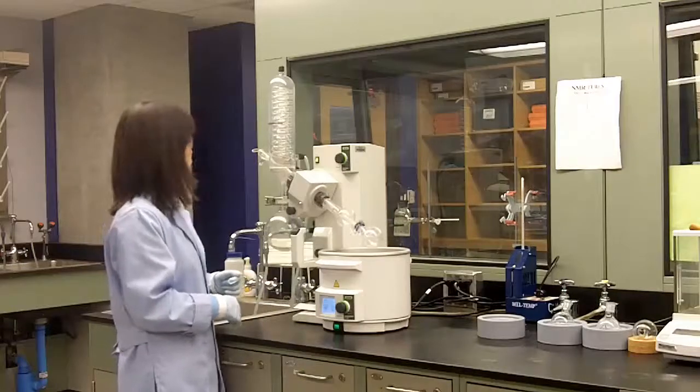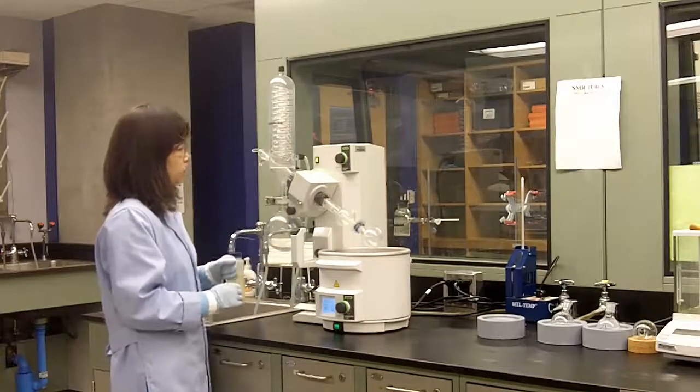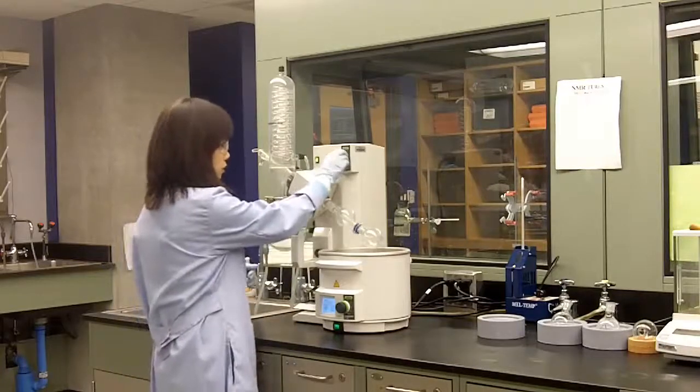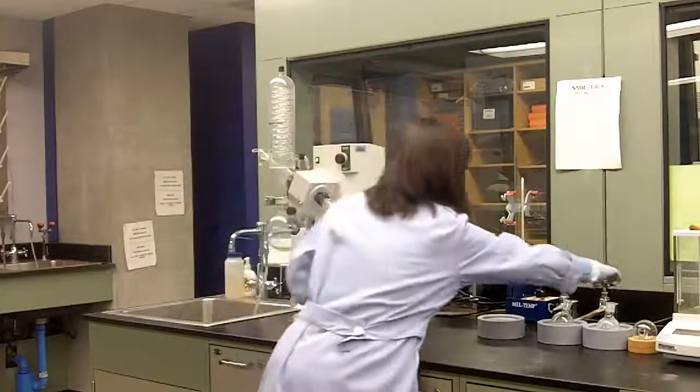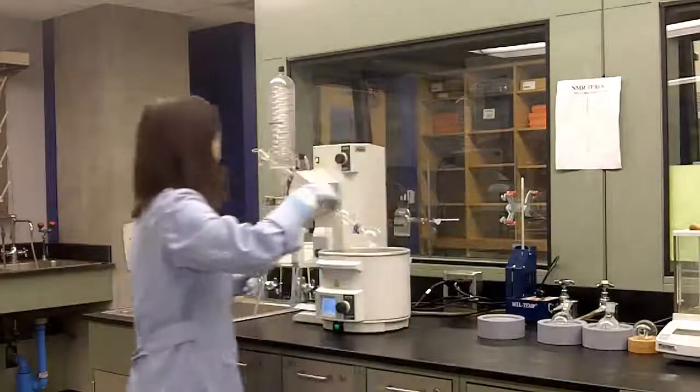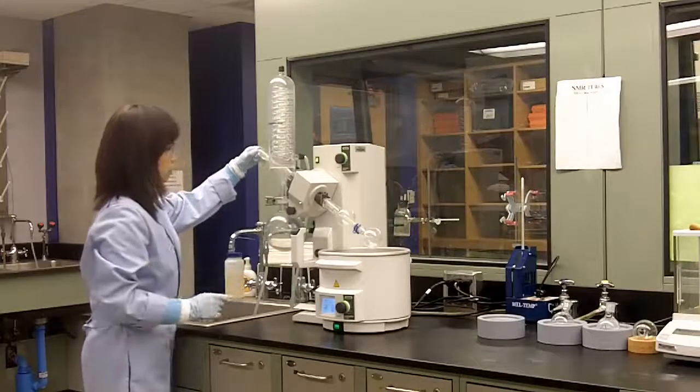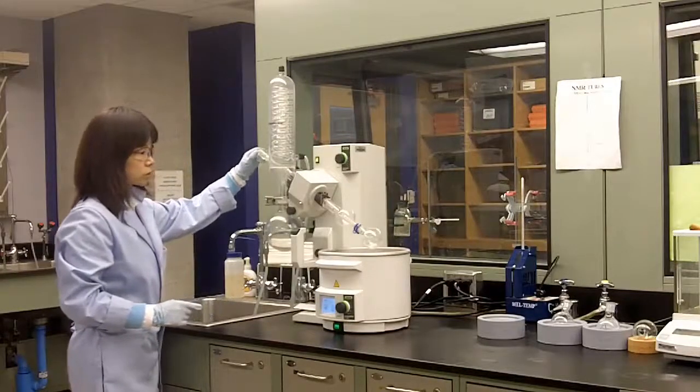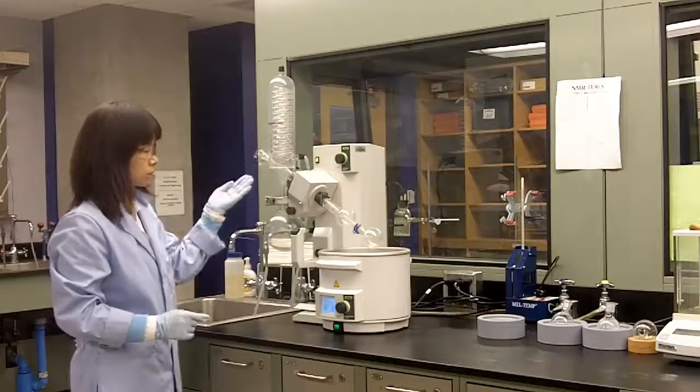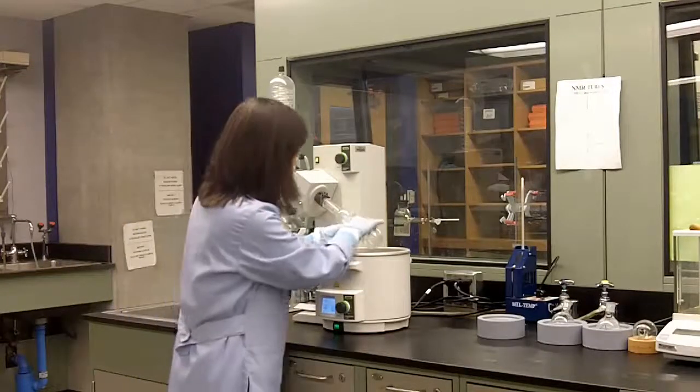Next we need to turn off the rotary evap. To do this, stop the spinning first. Then close the vacuum all the way in the clockwise direction. Then open this glass stopper connected to atmosphere. This will release the vacuum in the system, and then it's safe to remove your flask.